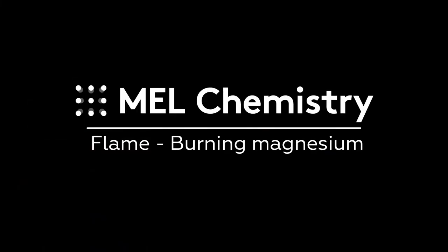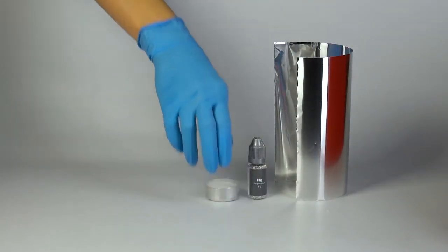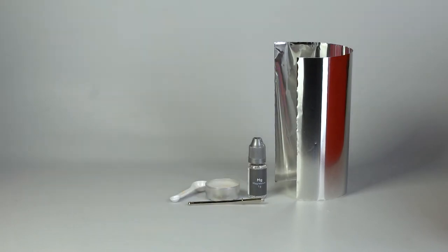For the burning magnesium experiment, you will need a sheet of foil, magnesium, a candle, tweezers, a measuring spoon, and some filter paper.